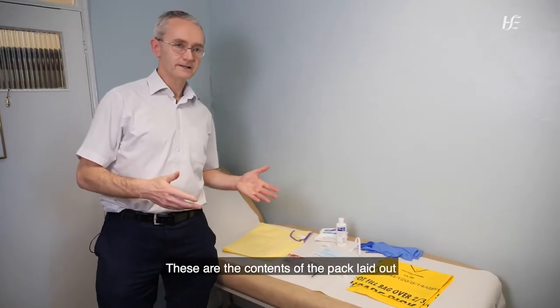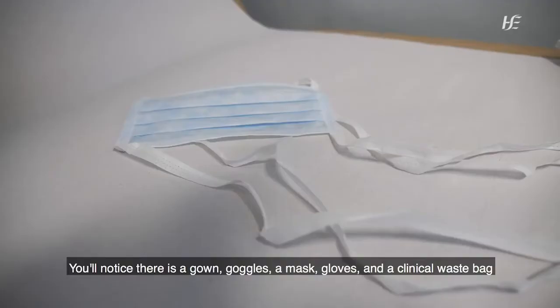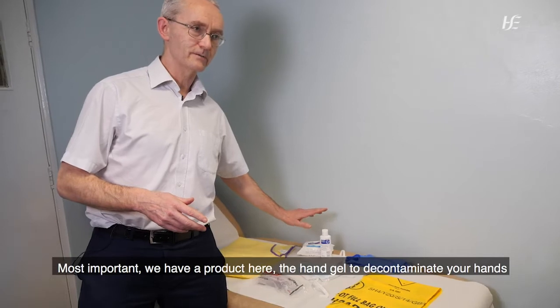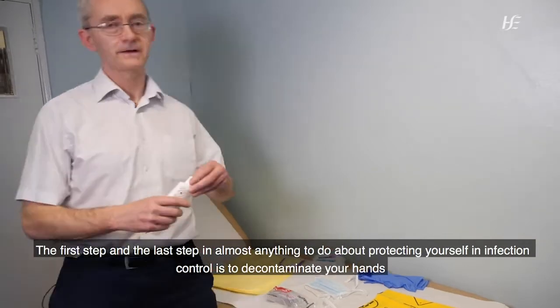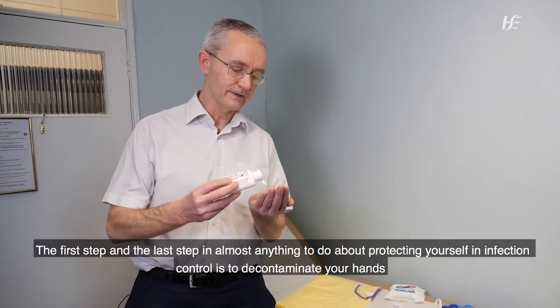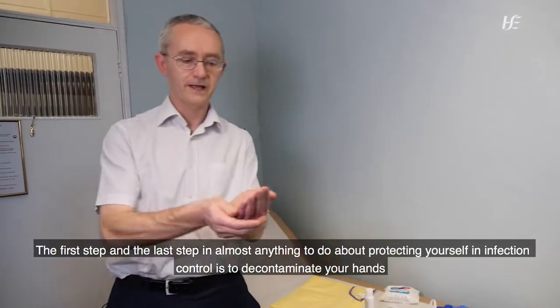Okay, so these are the contents of the pack laid out, and you'll notice there is a gown, goggles, a mask, gloves, and a clinical waste bag, and most important, we have a product here, the hand gel, to decontaminate your hands. So the first step and the last step in almost anything to do with protecting yourself in infection control is to decontaminate your hands.